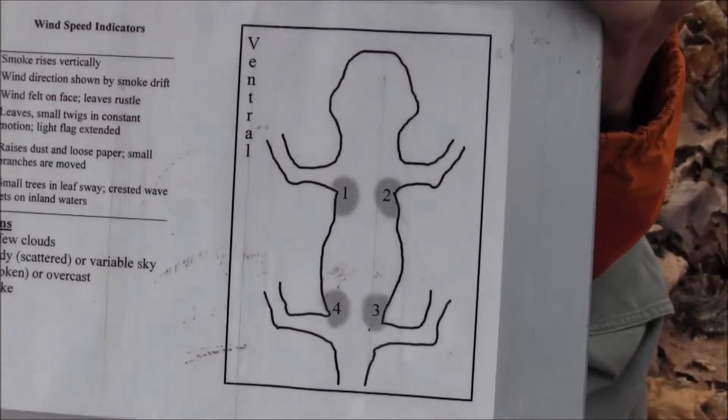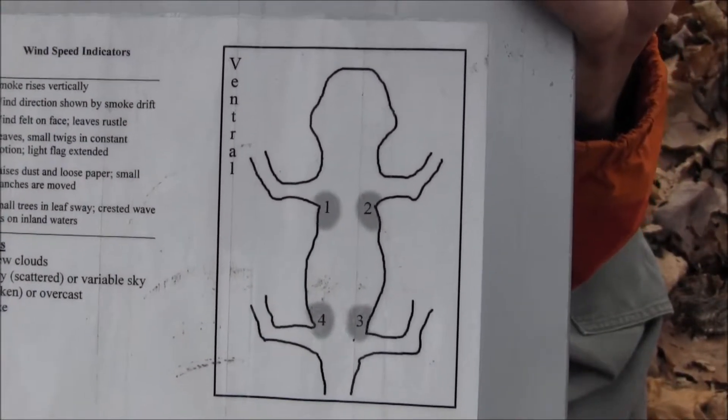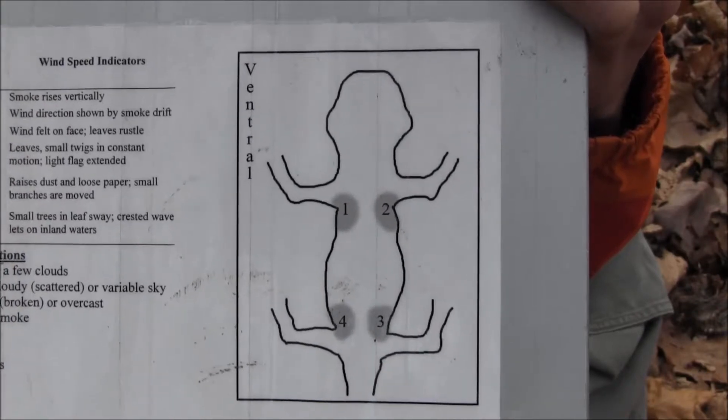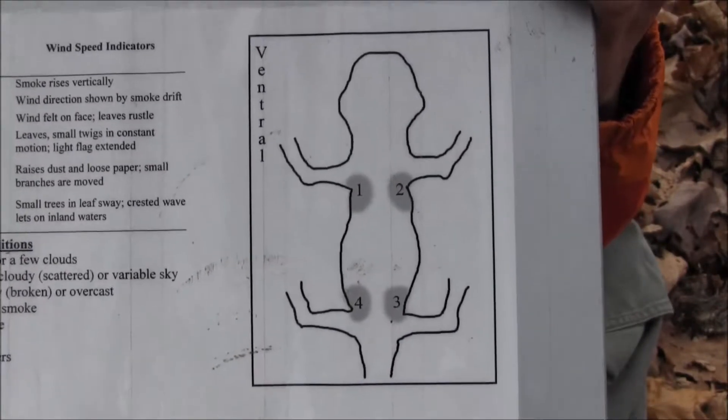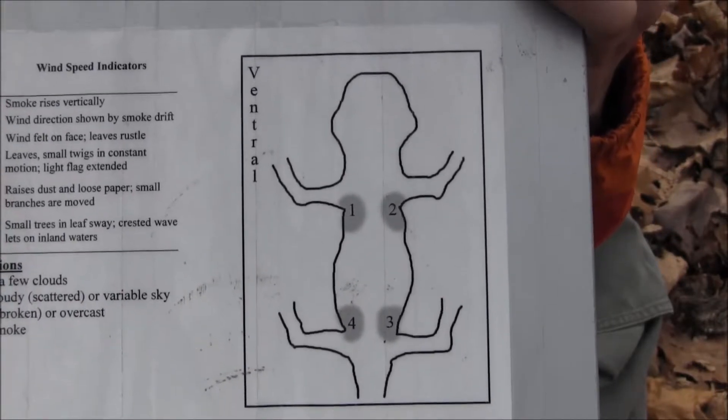So here I've got some salamanders that we've caught from our cover board arrays, and we'll start marking them with our unique identification code. We've got a specific marking scheme we're using here. Looking at the ventral side of the salamander, position one, position two, position three, and position four are four different marking locations.